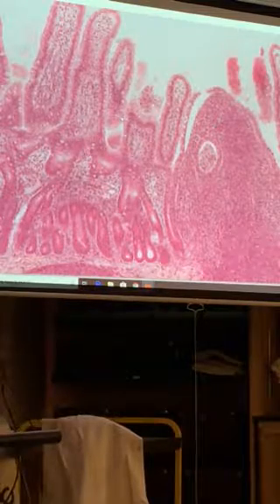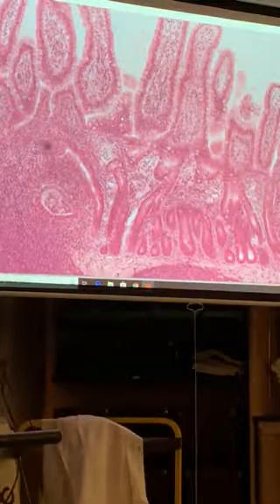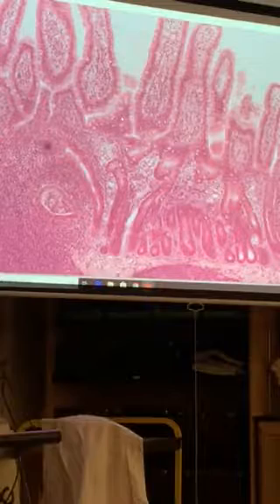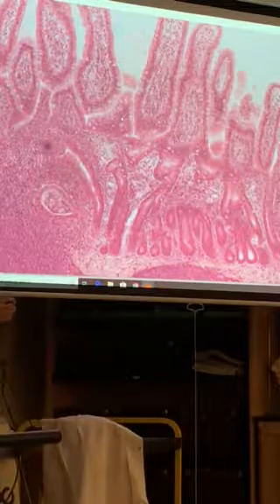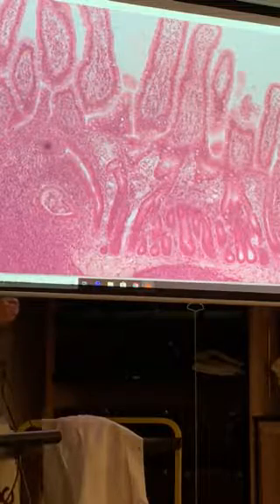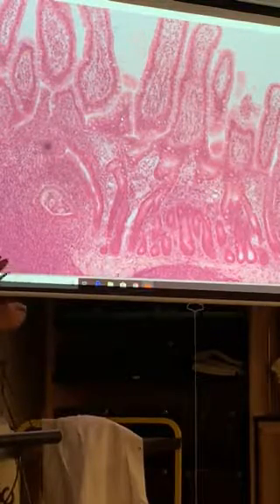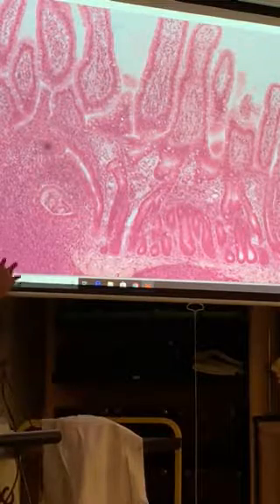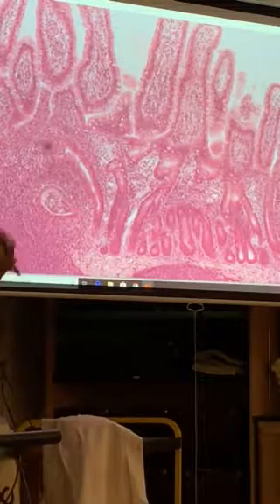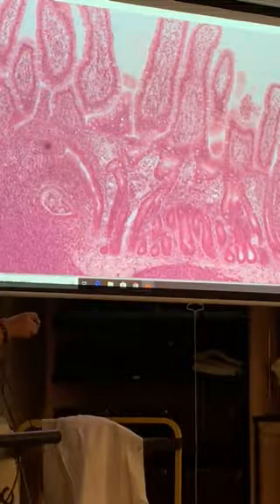Intestinal crypts. You're going to look deep in the mucosa, and we haven't actually gone over what they are in lecture, but it's pretty simple. It's the bottom of the villus, where it turns around and does a corner. It comes down, does a little corner and turns around. It doesn't look like it because this is two-dimensional, and this is a three-dimensional organ with tons and tons of villi. So it's the little pocket between the villi where you have regeneration.